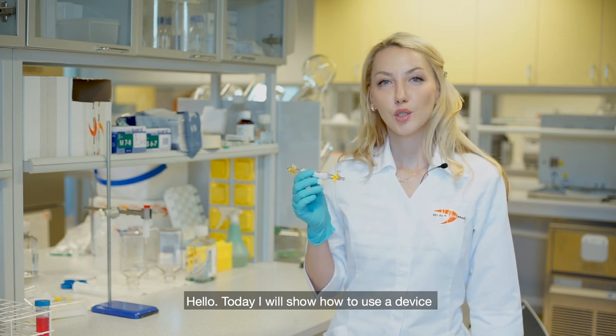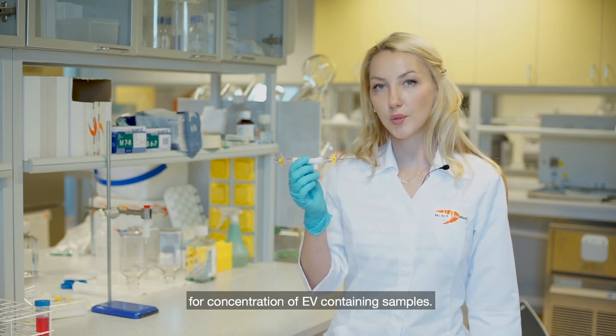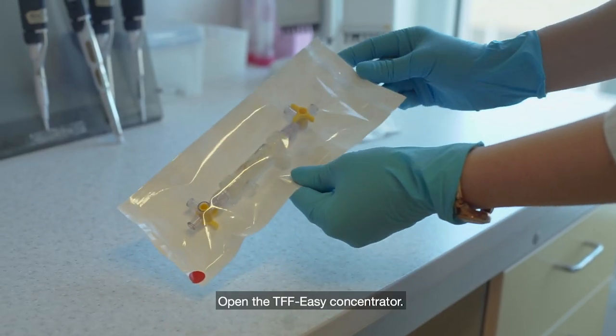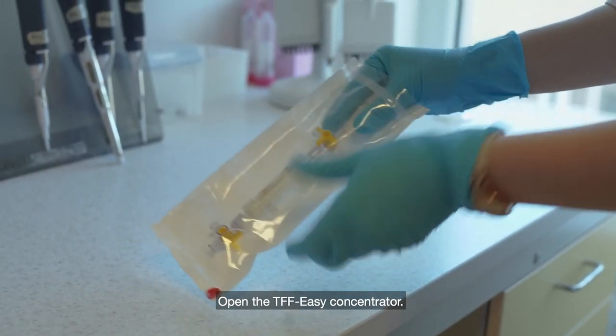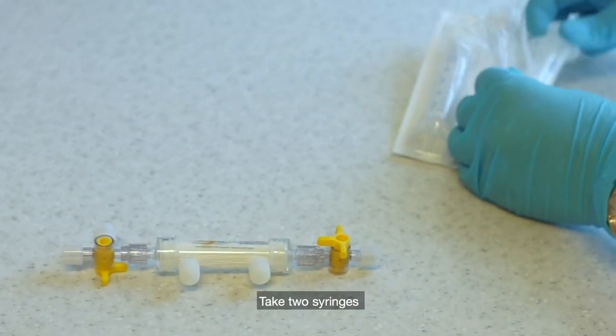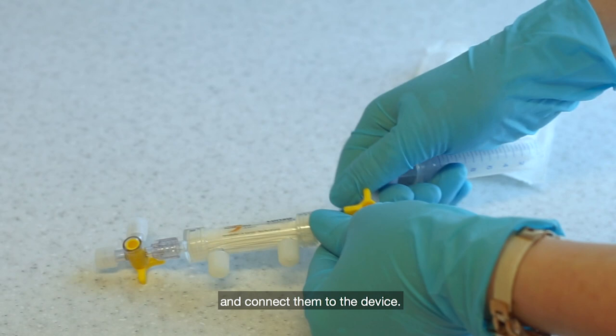Hello, today I will show how to use a device for concentration of EV containing samples. Open the TFF-Easy Concentrator, take two syringes and connect them to the device.